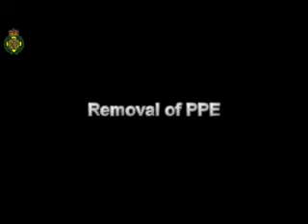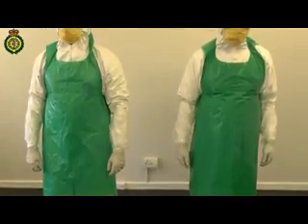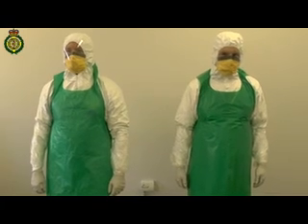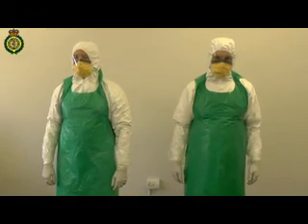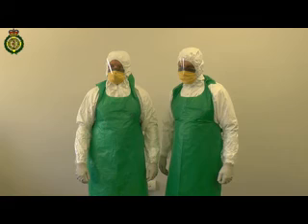Removal of PPE. Removal of Level 2 and Level 3 PPE is the same principle. Here we are showing the removal of Level 2 PPE. It's very important to remove PPE carefully and in a way so that the contaminated PPE is not allowed to contaminate any other area or the person wearing it.